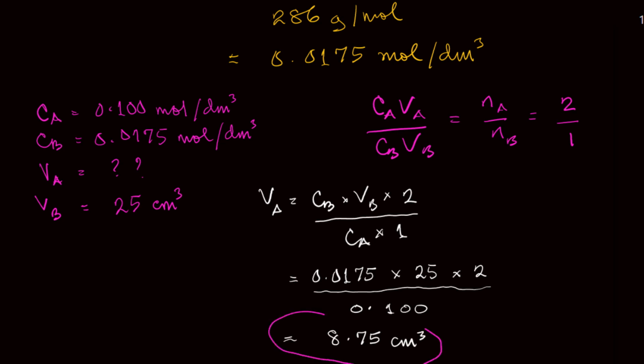So this gives us the theoretical titer value that you are expected to get in this practical examination. But remember, I said this is a theoretical value, so due to some human errors and interferences, there's a tendency that you will not get this exact value, but this will serve as a guide to you to know that you are doing the right thing.